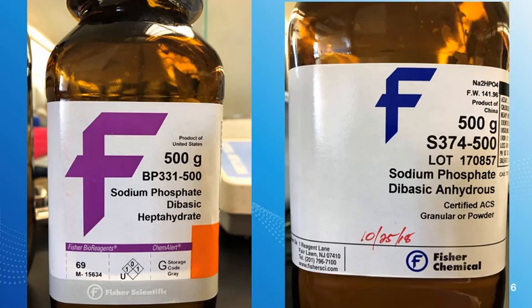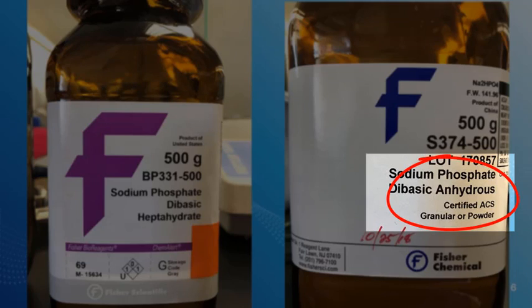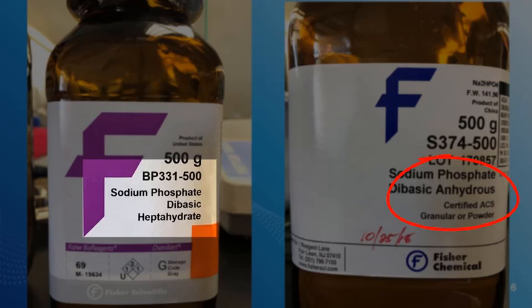Phosphate buffers are very typical for a biochemistry lab. When you prepare a phosphate or any other buffer that comes as a salt, pay close attention to the form it's delivered in, whether you get an anhydrous salt or a salt with several waters attached.